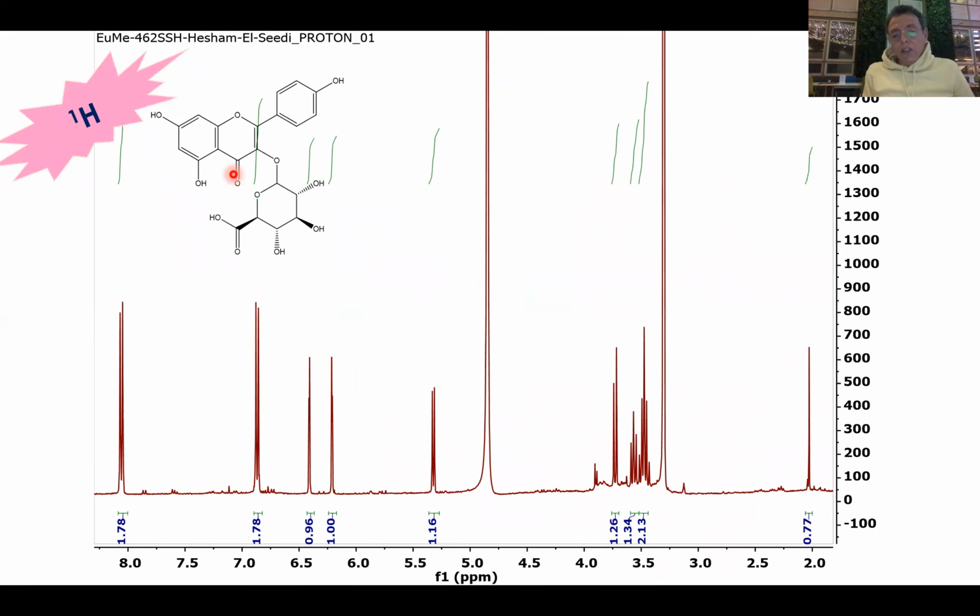If we go to another kind of spectrum, look with me, and we start to guess what kind of compound we have. Here is the aliphatic region until 6, then the aromatic region. And immediately, now I can hear you, that here these two must be an AB spectrum.